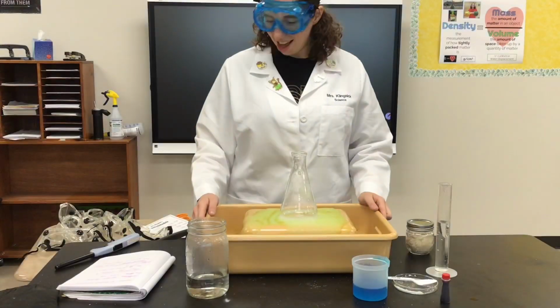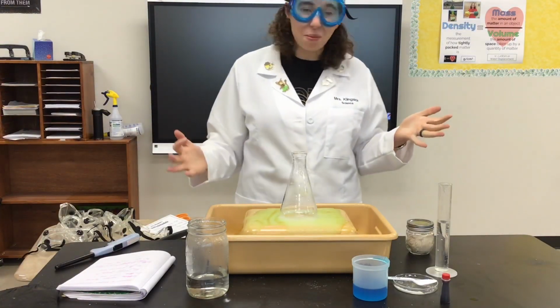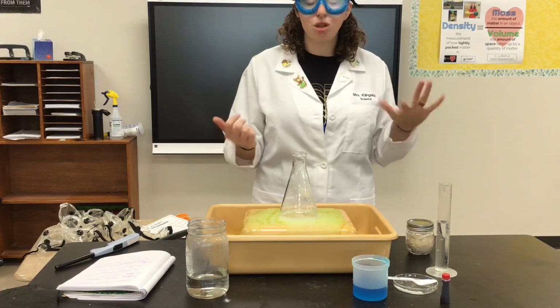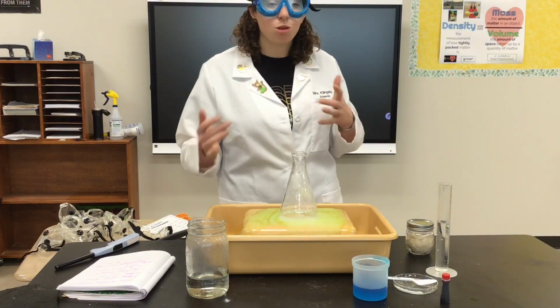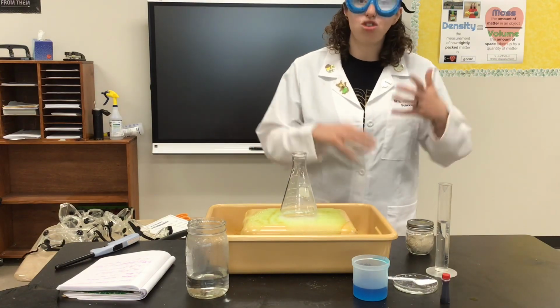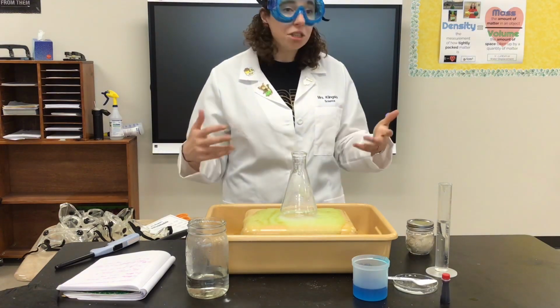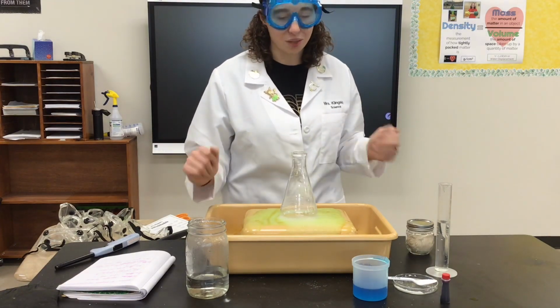Okay, for the next thing in our chemical roadshow, we're going to be making elephant toothpaste. Now, I know you've seen those videos with the ginormous explosion, and those are super cool. They're all over YouTube. Our elephant toothpaste is not going to look exactly like that. One of the reasons is we're not using the strongest chemicals. Those people who do those giant ones have stronger chemicals. Also, they might have different combinations of materials that make those explosions bigger. So ours will not look that big, but it will still look really cool, okay?